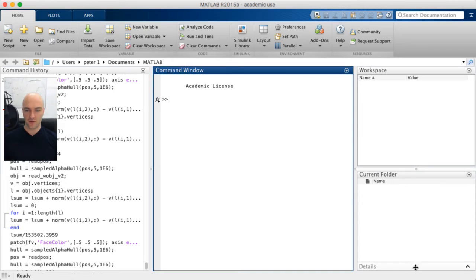Here we've got the current folder. The current folder means you can see what programs and scripts you've got available. We're going to have most of them in just one folder and navigate from that folder. Sometimes we will also need to unlock some subfolders where we have routines that would otherwise clutter our folder structure. Matlab by itself doesn't know how to load atom probe data because it doesn't know what data formats we have, so we need to tell it how to do that.